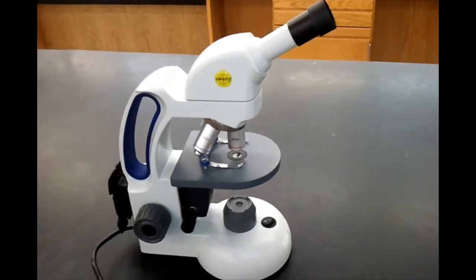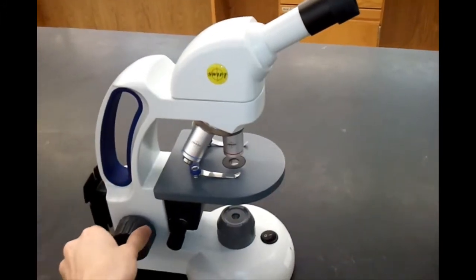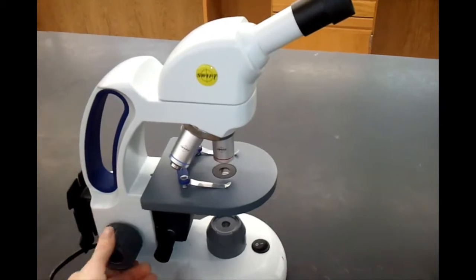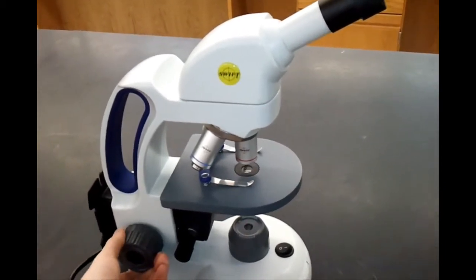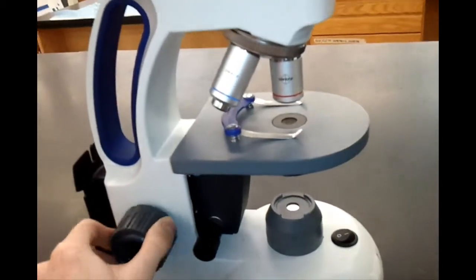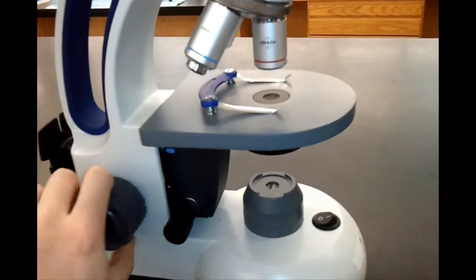In order to bring an image into focus, you would use the coarse and fine adjustment knobs on the side of the microscope. The larger knob is the coarse adjustment knob, and you can see that it moves the stage up and down to bring the image into focus.